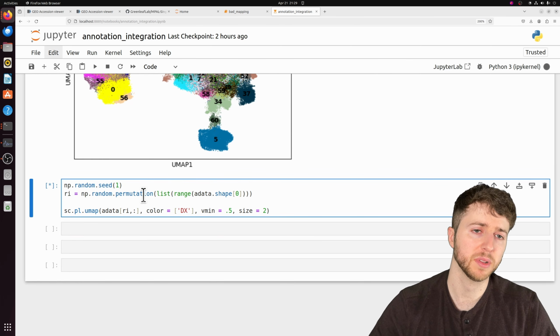So these are probably a lot of AML blasts in here, which is that immature blast type cell that accumulates in AML. When I first picked this data set, I was like, it's PBMCs, how hard can it be to label? Usually these kind of automatic transfer labels do a really good job for PBMCs. That definitely wasn't the case with this data set. I actually had to go through the literature to find different markers for these blast cells. So here is just 2 sources I found. And I just pulled a list of genes from this.